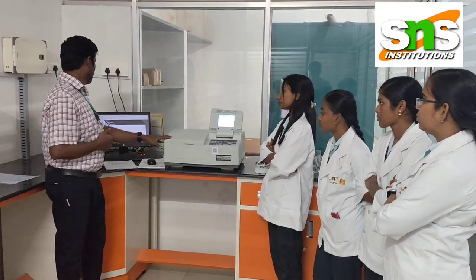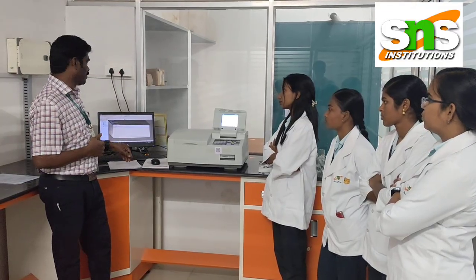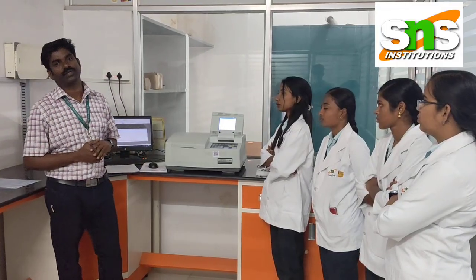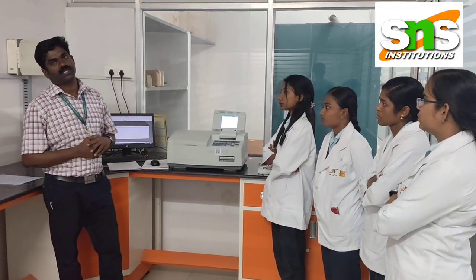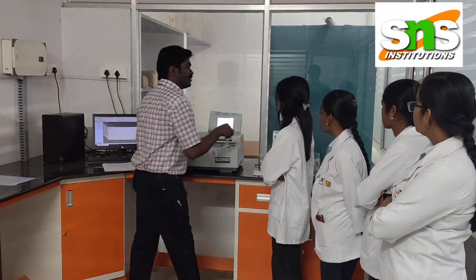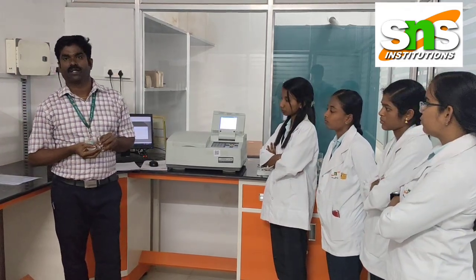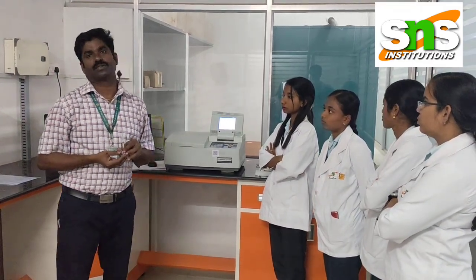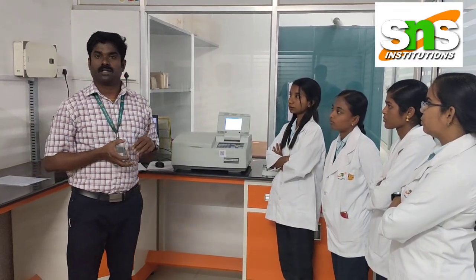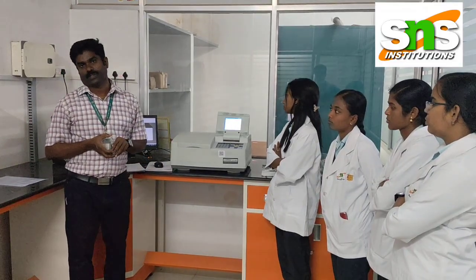In this, we use two modes: one is photometric mode, and the other is spectrum mode. In photometric mode, we find out the absorbance of different samples. We have dissolution samples, and we perform studies related to drug discovery and mixing studies. In this, we perform photometric-based absorbance measurements.